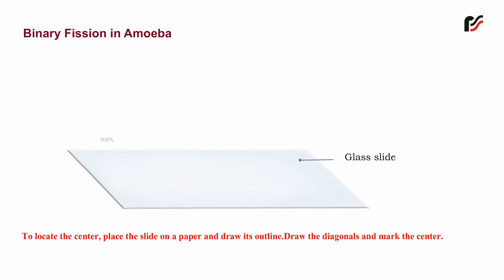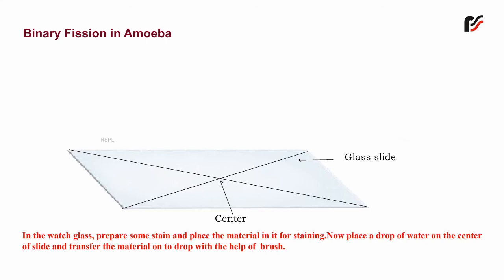To locate the center, place the slide on a paper and draw its outline. Draw the diagonals and mark the center. Now place the slide, prepare some stain, and place the material in it for staining.